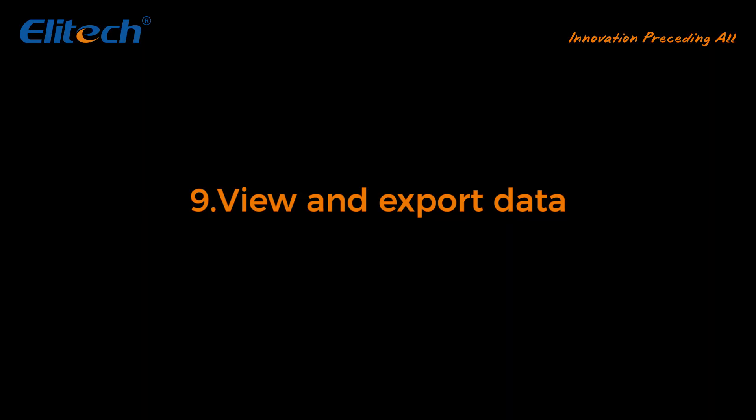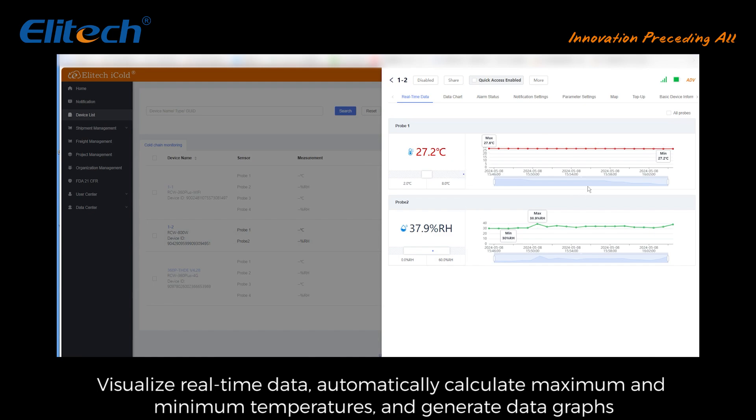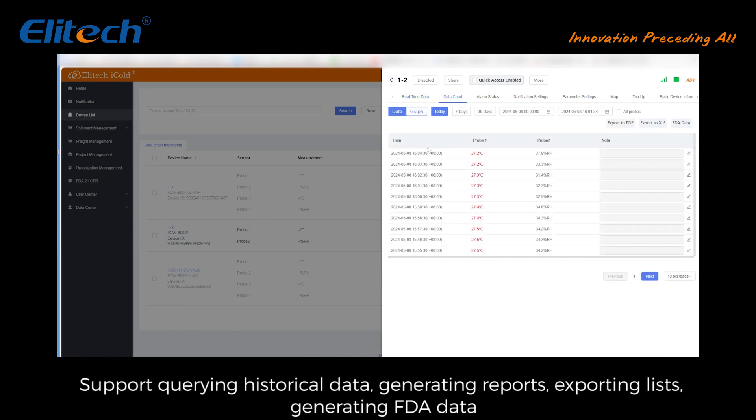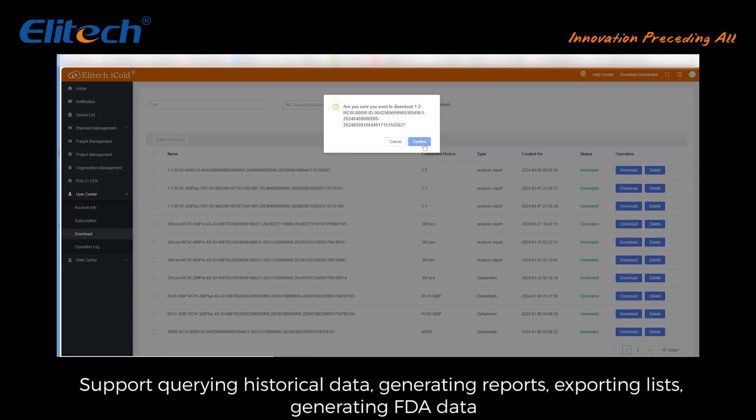View and export data: real-time data — visualize real-time data, automatically calculate maximum and minimum temperatures, and generate data graphs. Data chart — supports querying historical data, generating reports, exporting lists, and generating FDA data.